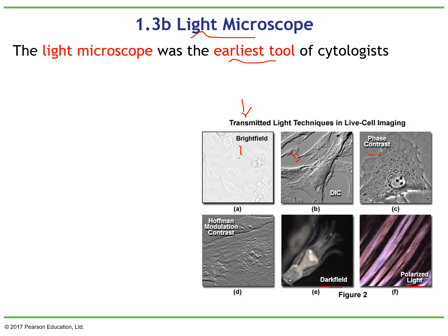In all of these, what we are doing is using different tools of physics to change the light in different ways, using these optical principles to create different brightness and contrast of the samples. Okay, so the bright field is wonderful to study different structures. However, there are different cells that, if they're alive, can be transparent.